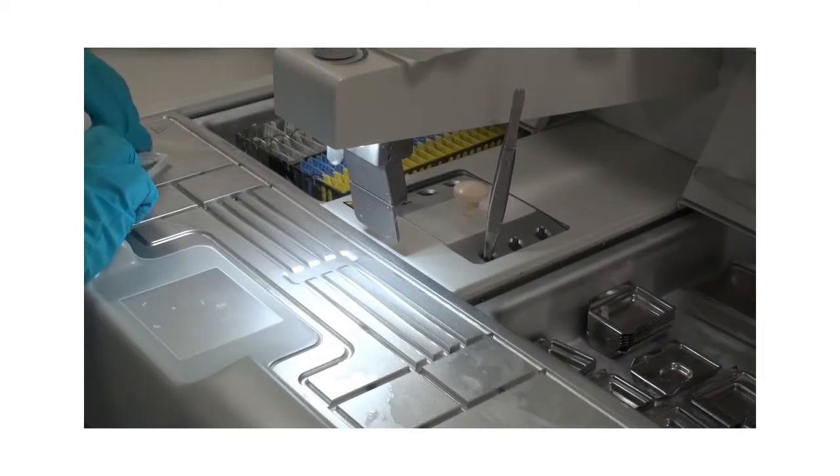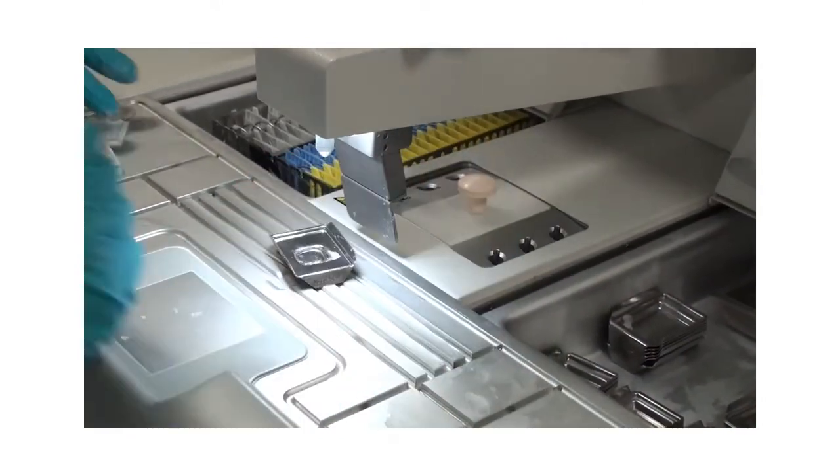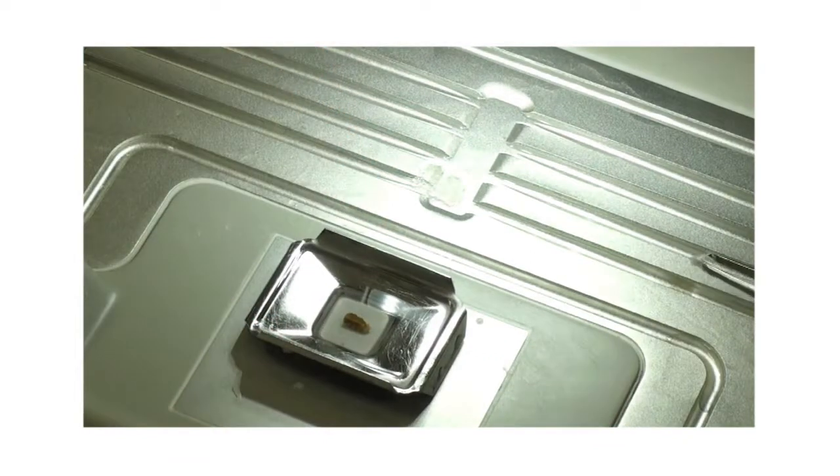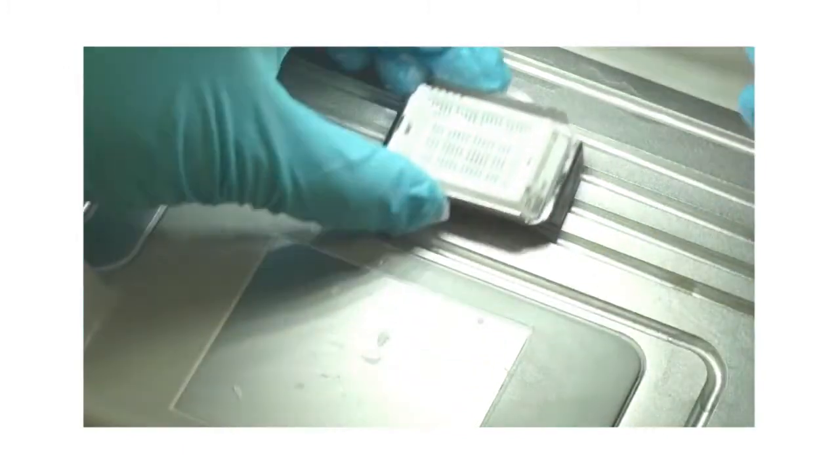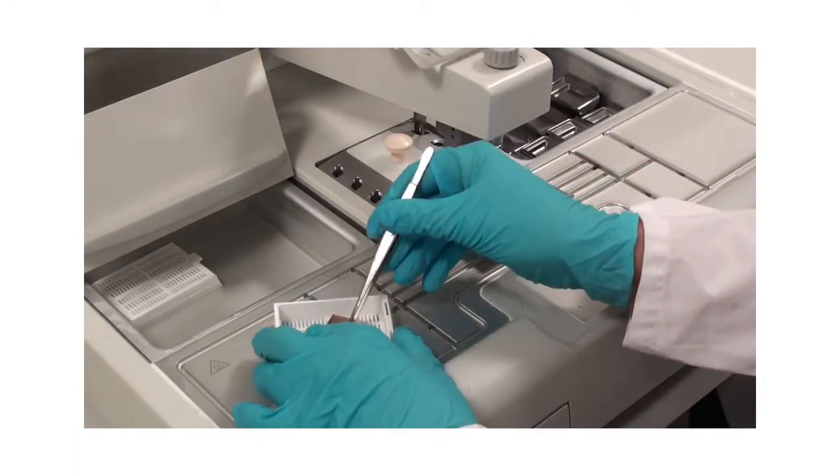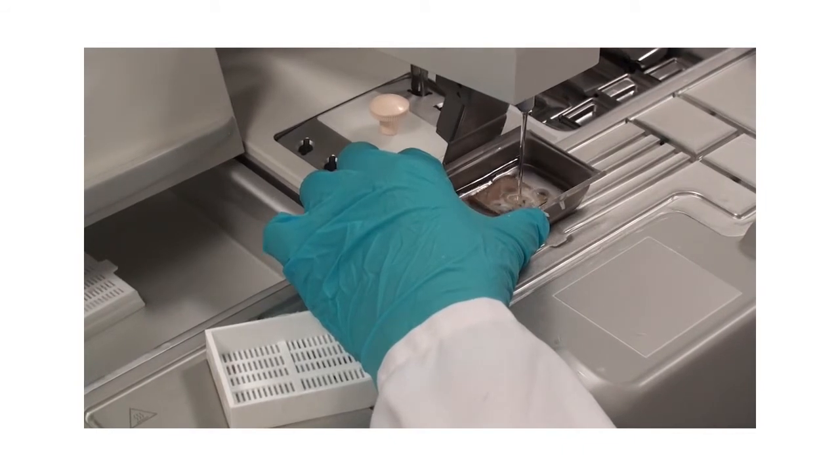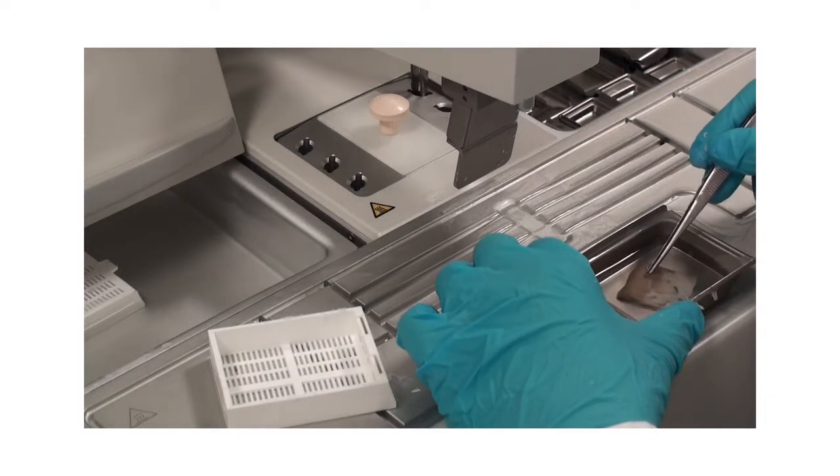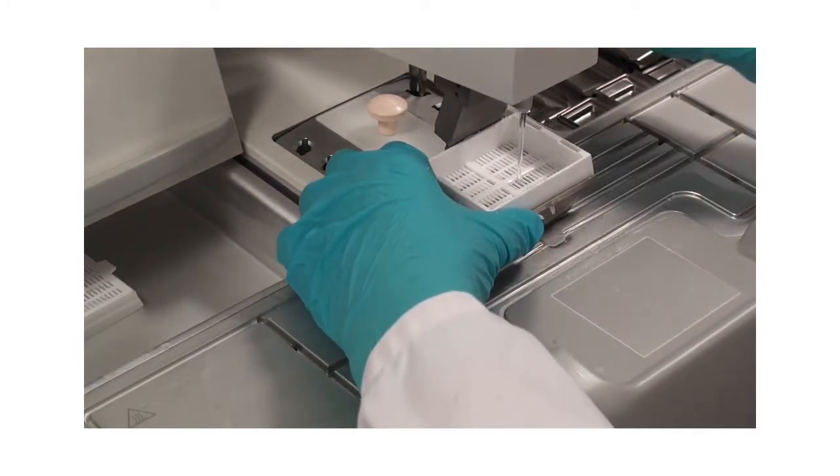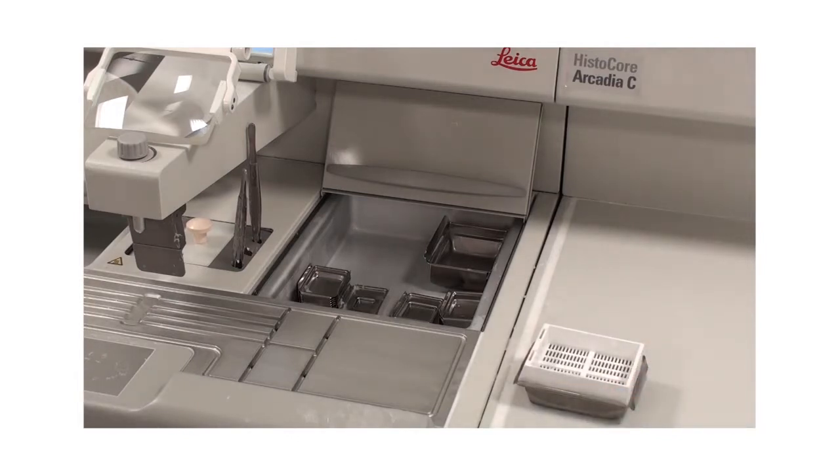Open your cassette and select a suitable mold, depending on the size of the tissue. Transfer the tissue to the mold and start to release paraffin. The large cold spot is designed to assist tissue orientation even with large super mega cassettes. Place the cassette body on top of the mold and fill it up with paraffin.